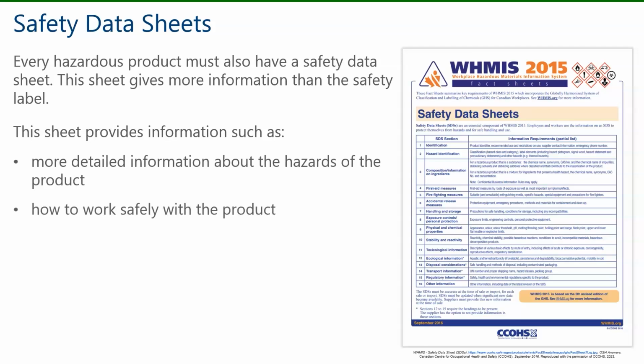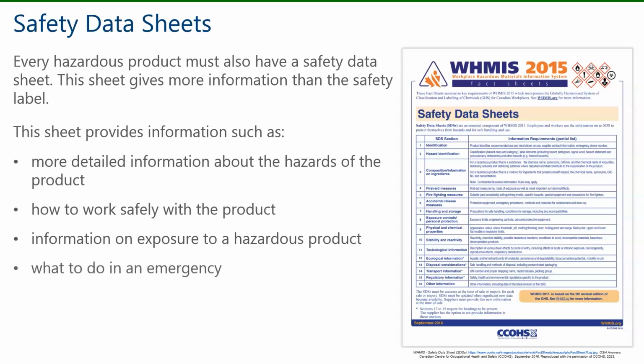For example, you may need to wear a mask. Information on exposure to a hazardous product. What will exposure do to your body? And what to do in an emergency. For example, do you induce vomiting?